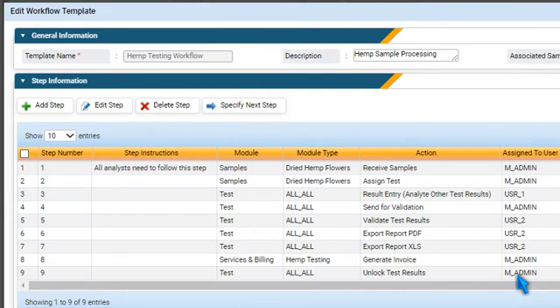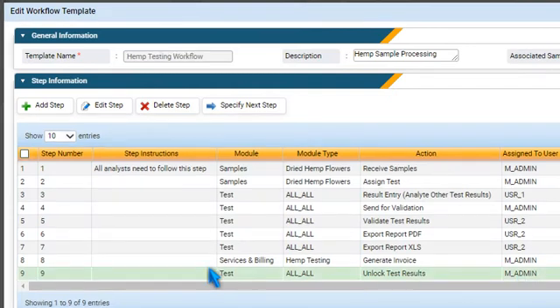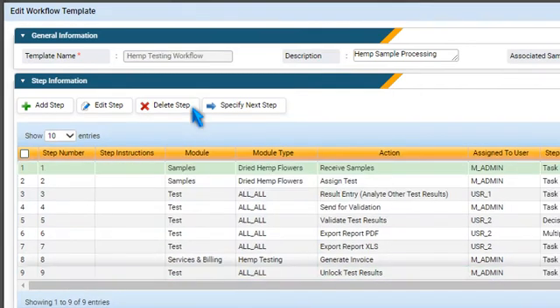To delete an existing step, select it and press Delete Step. You can delete only the last step.